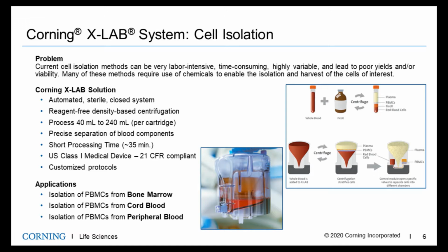Now, this Ficoll-based method has served its purpose for many years, but it does have several drawbacks. Aside from the need to add that additional reagent, this is a tedious, labor-intensive manual process with a high degree of sample and operator technique-based variability that can result in reduced yields and viability.